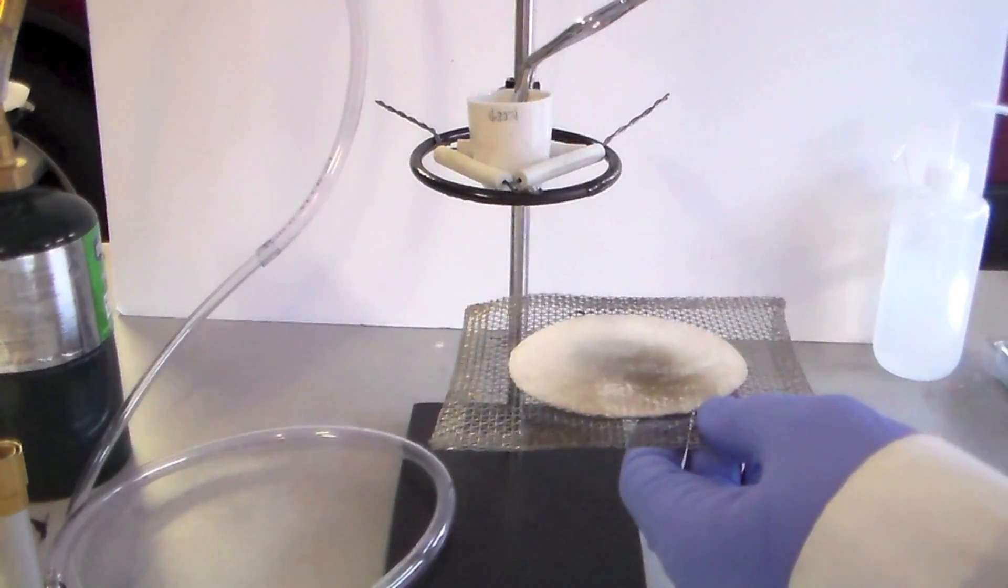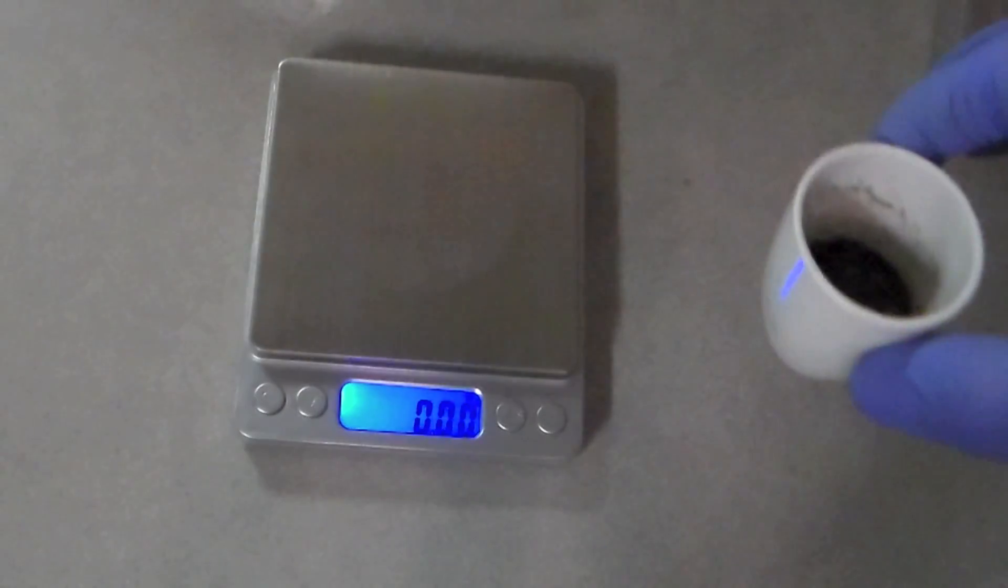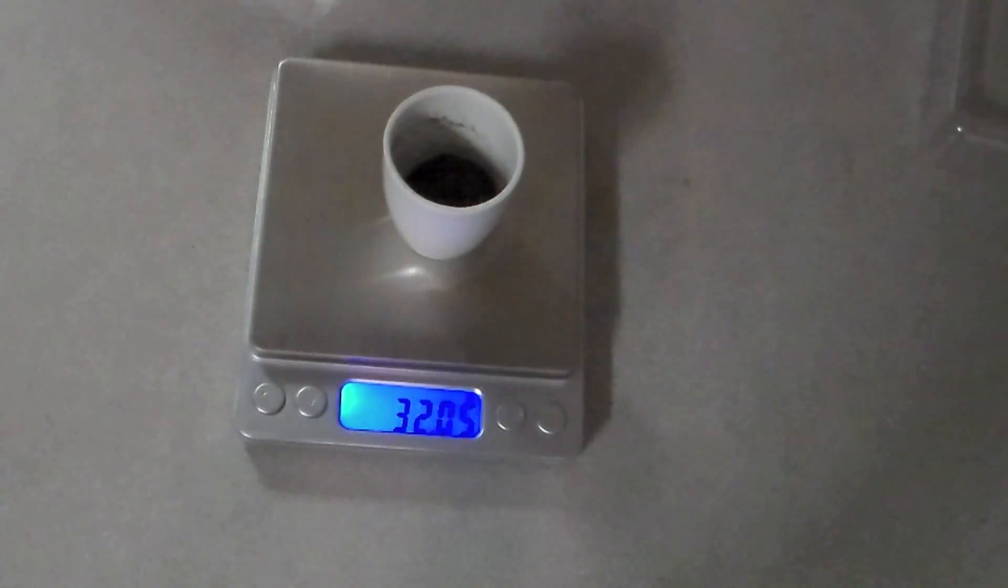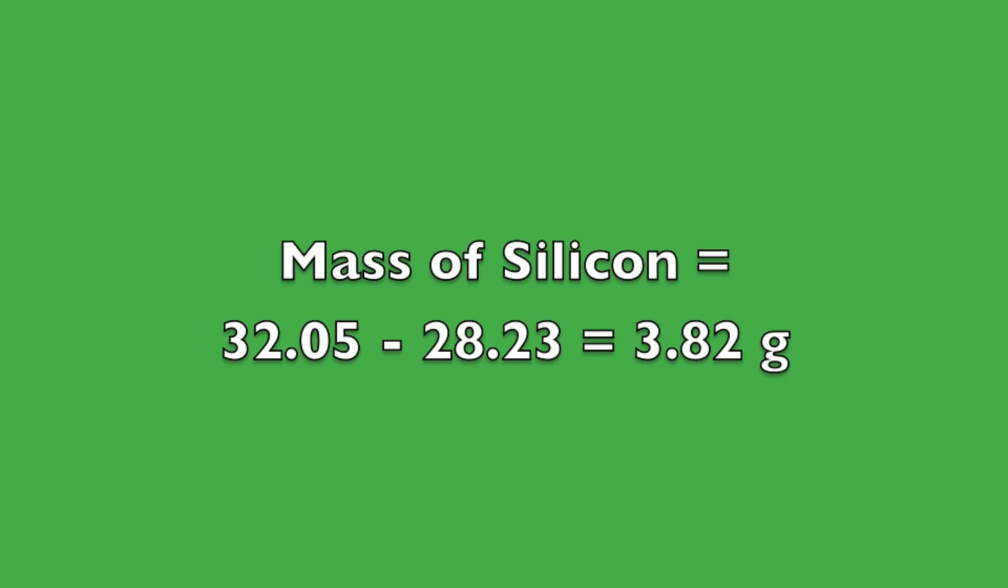I then heated it over a Bunsen burner until the solids were completely dry. I then placed the crucible on a heat resistant pad to cool it down. Once it had cooled to room temperature, I re-weighed it and recorded the mass as 32.05 grams.